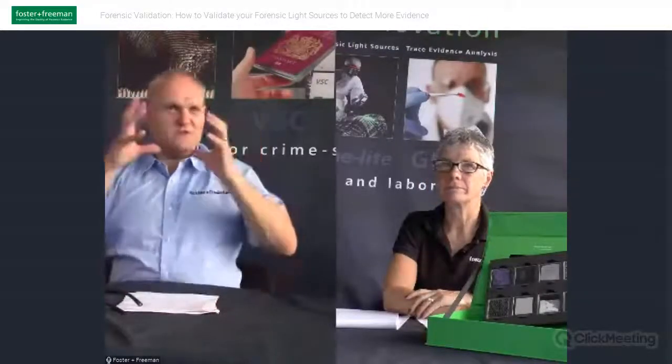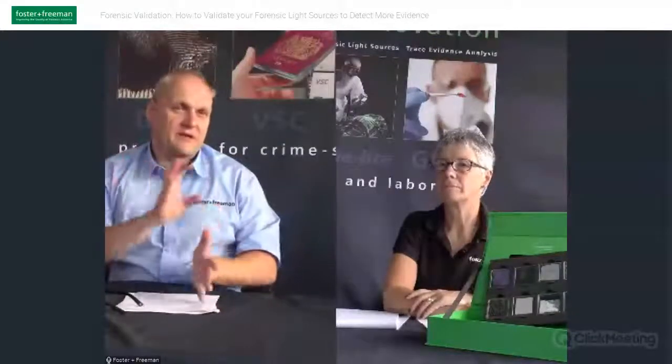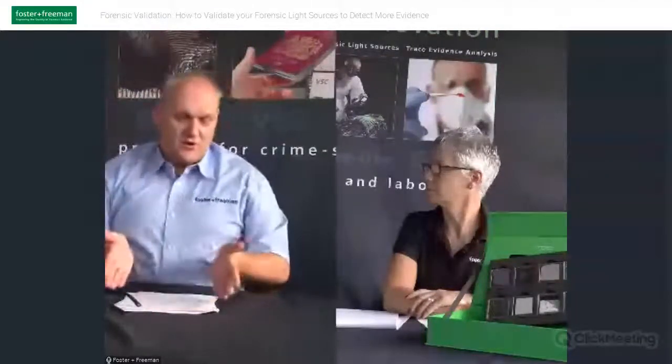people often put body fluids together. Well, they actually react slightly differently. You know, semen will react slightly differently to sweat and saliva and so on. You know, they're similar, but they're not the same. But more again, the substrate, the background is so important. And, you know, everybody always asks, every single question you get asked, what's the best light source for body fluids? And the answer is whichever gives you the best contrast between the background and the body fluid.